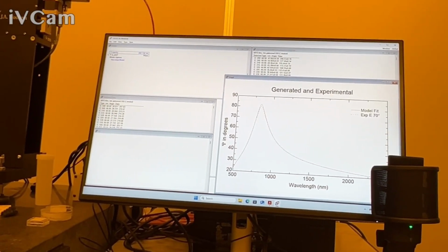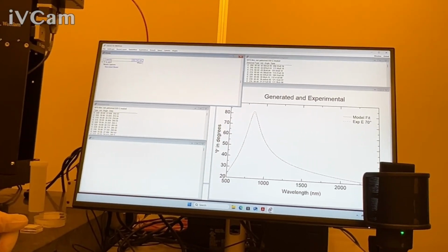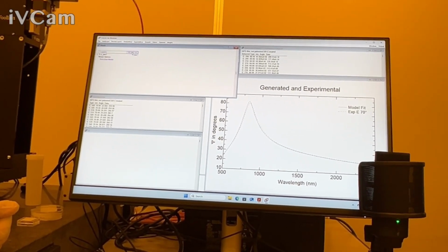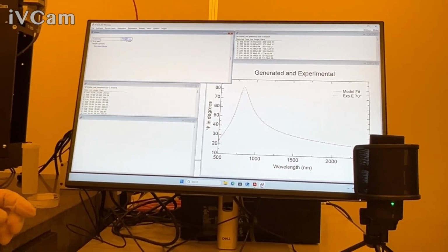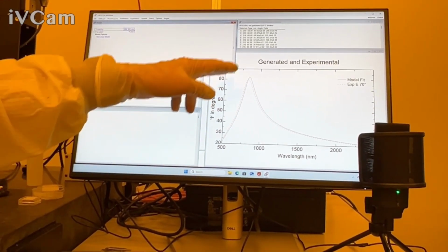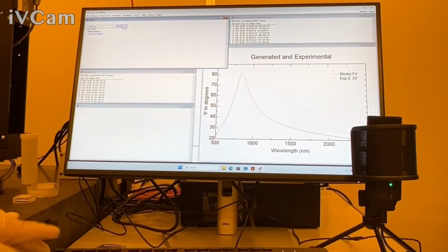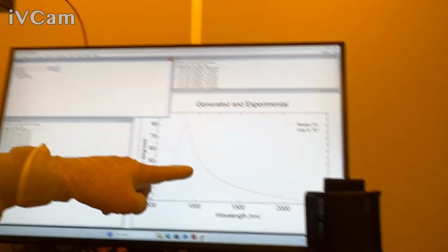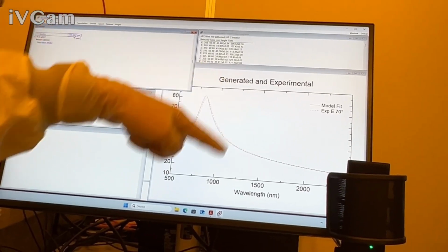But you can imagine, again, as I mouse roll this, let's say some of the beam was the average, but some of the beam saw something this thick, and some of it saw something 10 nanometers less. So if under the beam you average that plus that plus that, essentially what happens is anywhere you have a peak in the data, your actual measurement is going to be suppressed. If you're on a slope, they actually average back to the same value.